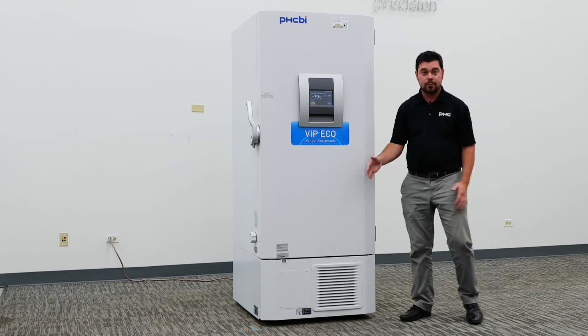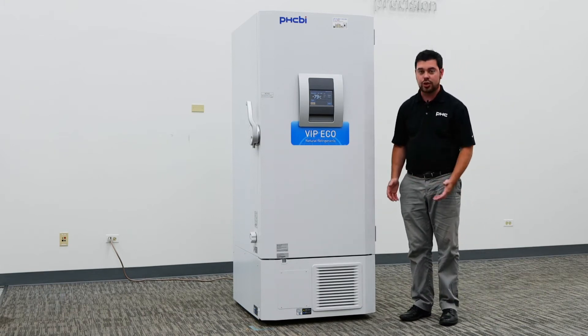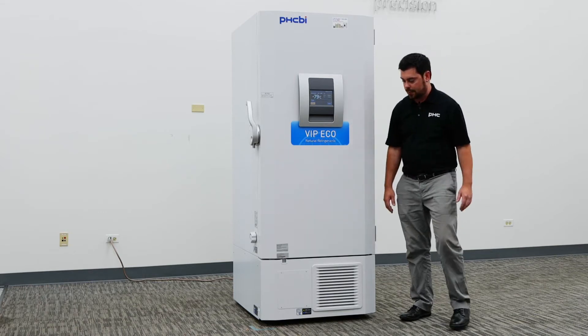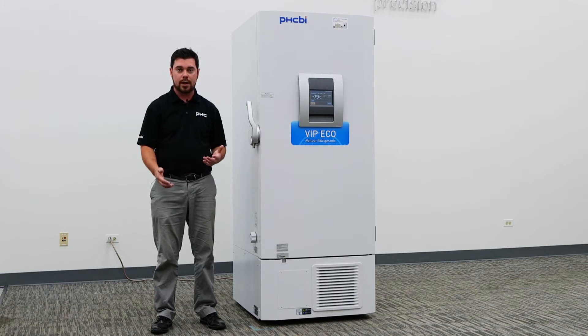This will help maintain performance of your minus 80 freezer and allow it to actively reject heat from the chamber to the existing air. This is something that should be done at least every three months, or more frequently depending on environmental conditions.